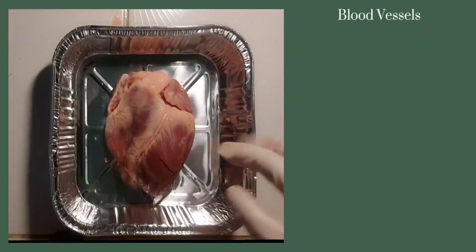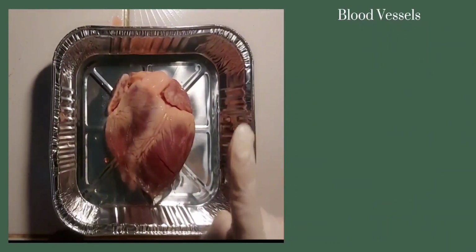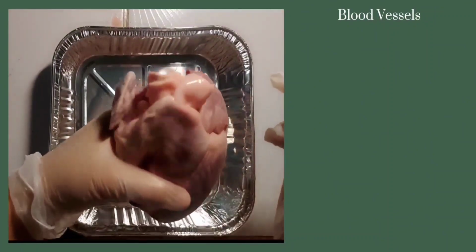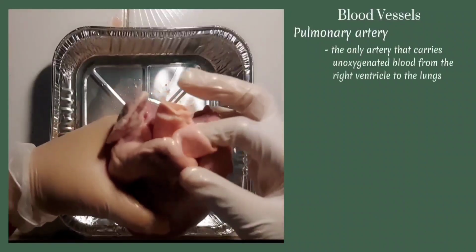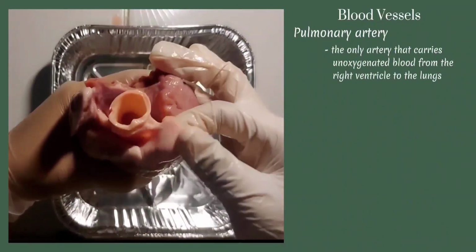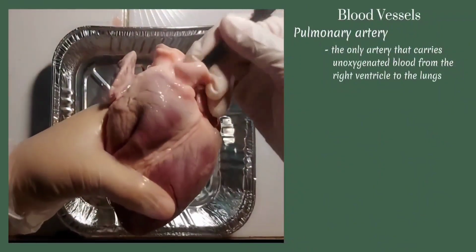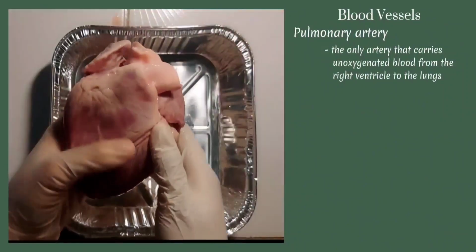Now that we are done locating the four chambers, we are now going to identify the blood vessels of the heart. Now there are three blood vessels, the veins, arteries, and capillaries, but we'll deal mostly with the artery and veins. This part right here is the pulmonary trunk or pulmonary artery. This is the only artery that carries unoxygenated blood. It brings unoxygenated blood from the right ventricle to the lungs. If you push down your probe through this artery, it leads you to the right ventricle.